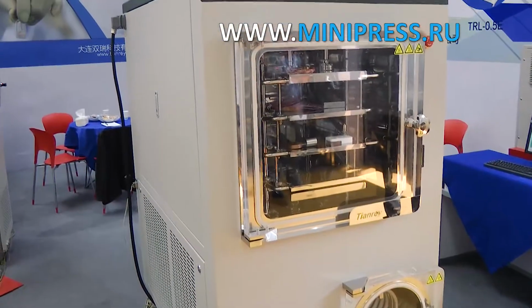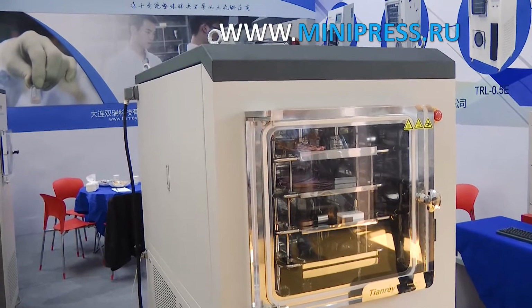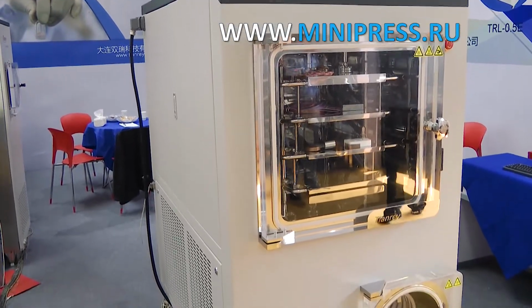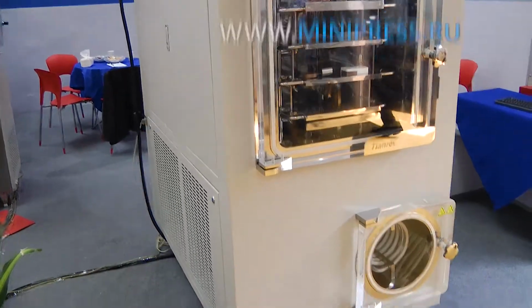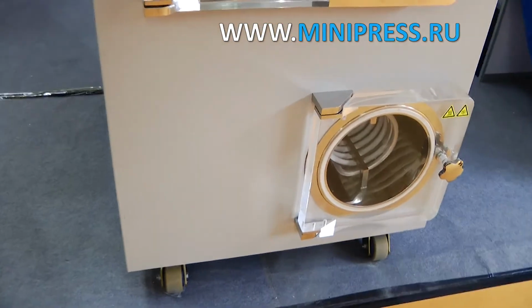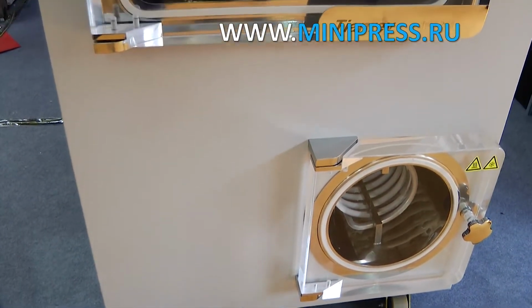He suggested a dryer option that was popular with customers and production proven. I agreed to consider it. The manager emailed me the passport, instructions for use of the equipment, and a video demonstrating the machine. The vacuum freeze dryer was made of stainless steel. The doors of the drying cabinet and cooling chamber are made of transparent polymethylmethacrylate for monitoring the process.